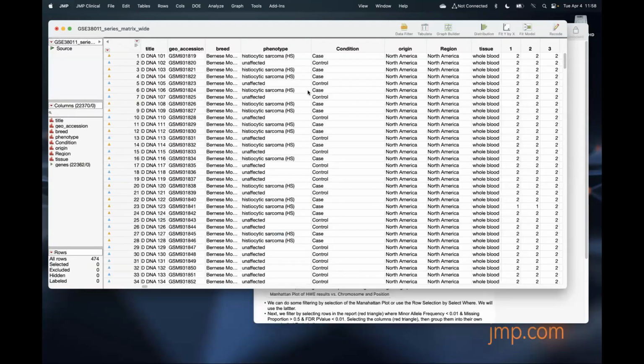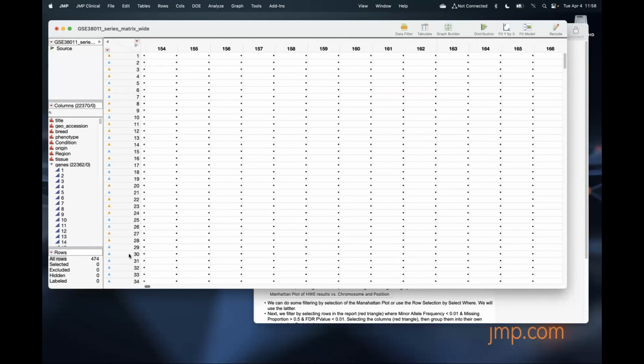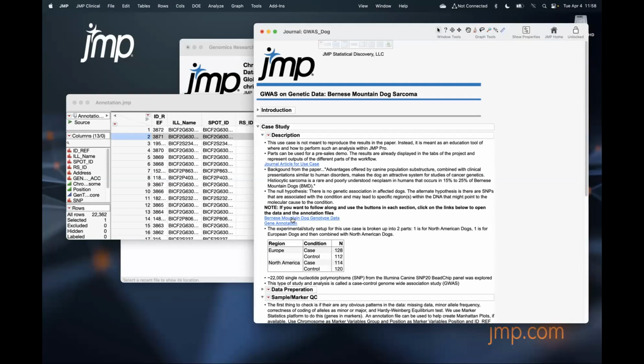All right, so let me back up. Let's see where I went wrong. That's why. I should have, everybody should be there. Oh, I'm missing a few things, aren't I? That's kind of a problem. Let's try that again. It's always a good check to see what happened. Apologize for that.